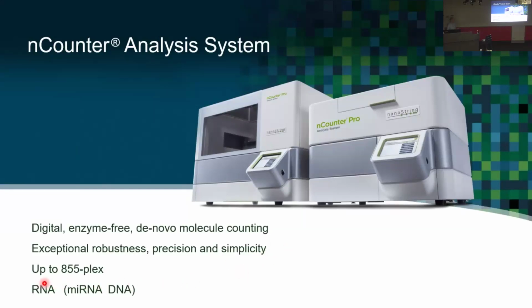It's a multiplex technology, so you do multiple things in the one tube. All your running controls, plus, minus, negative controls, positive controls, processing controls, everything's built in, including all of your housekeeping genes and all of your targets for any number you want, up to a maximum of 855. It's mostly used for gene expression studies, but it works very well for microRNA, and also DNA when it's looking at copy number variations. These are kind of arcane and really limited to human and mouse, but for RNA, it does everything.